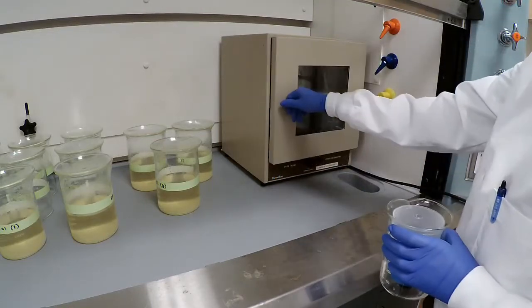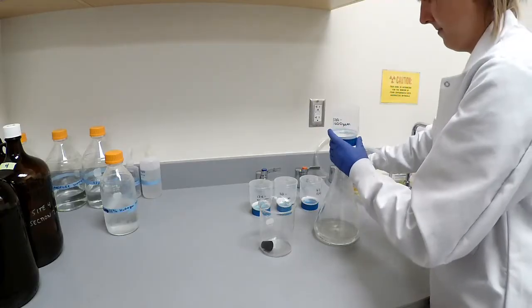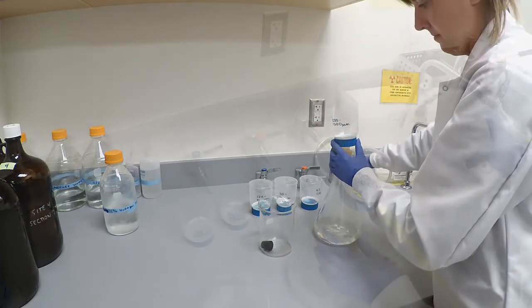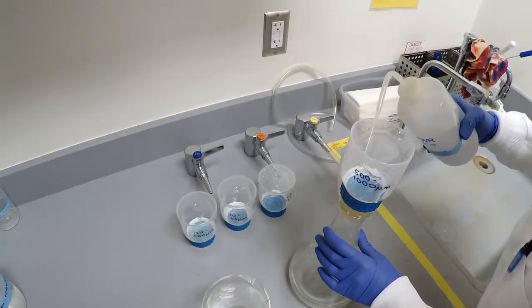The next day, vacuum filter off the hydrogen peroxide. Rinse the sides of the filtering unit with 20% 2-propanol.